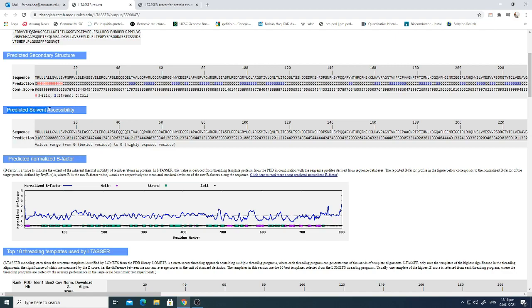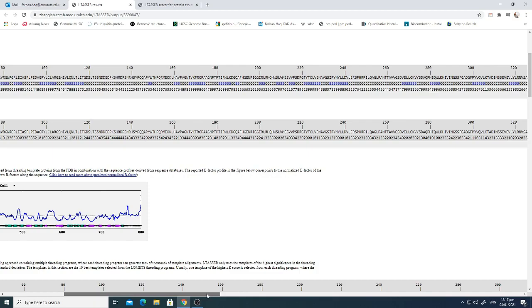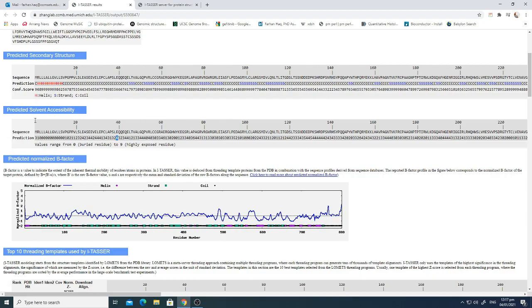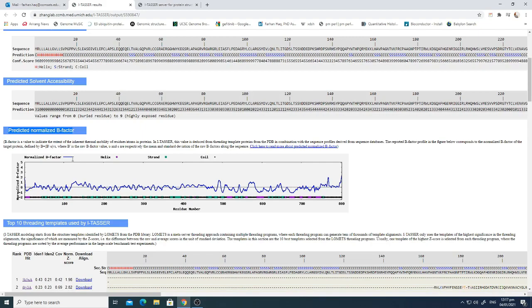The next heading shows the predicted solvent accessibility of your protein sequence. This tells you whether the structure is hydrophobic — a buried residue — or a highly exposed residue. Ranging from 0 to 9, the hydrophobicity or hydrophilicity is predicted. For instance, all 0s means the region is highly hydrophobic and buried, while a value near 6 indicates it is closer to the hydrophilic part.